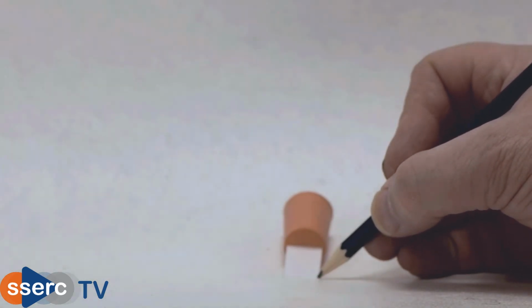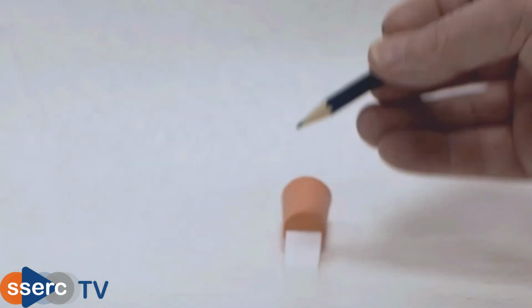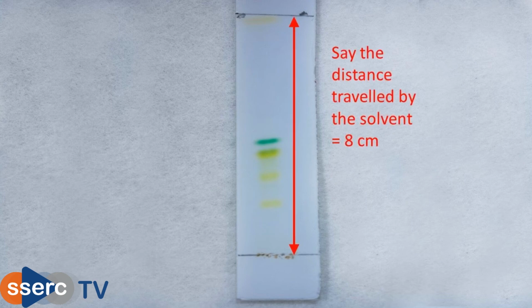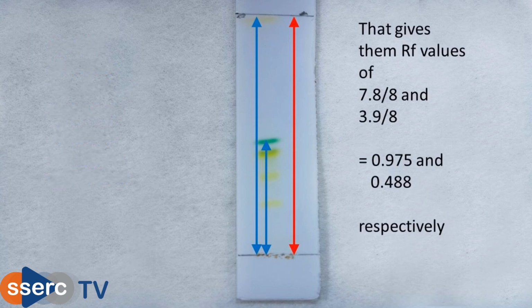The reason for doing this immediately is that once it's dried you won't be able to see where it had reached. And the reason for doing it at all is that a characteristic feature of any pigment in a particular solvent is that it will always travel the same distance in relation to the solvent. You divide the distance the pigment travelled from the bottom by the distance the solvent travelled from the bottom, and this gives you a value called the RF value. You can look up RF values and use them to help you identify any pigments you can see.